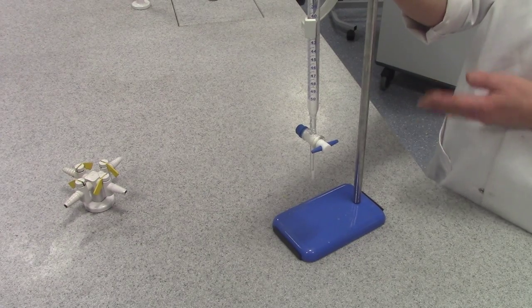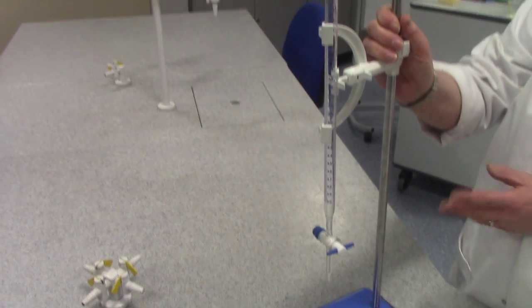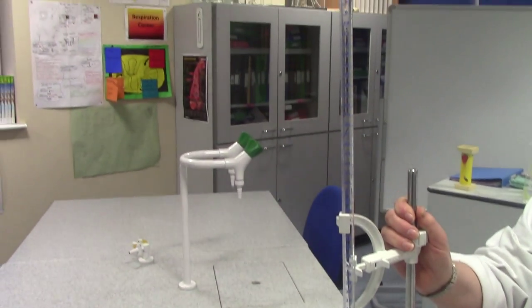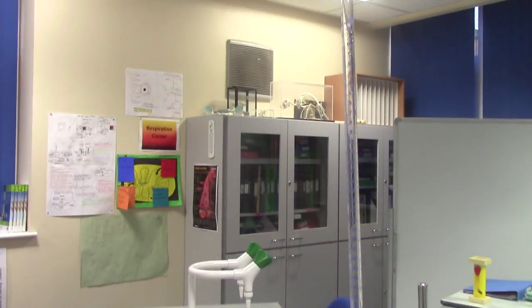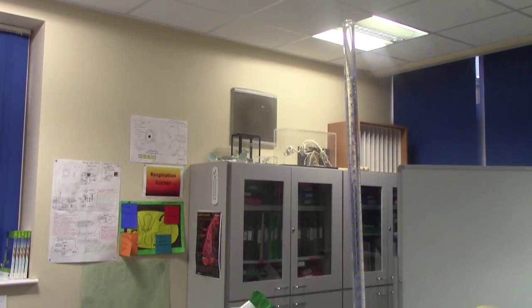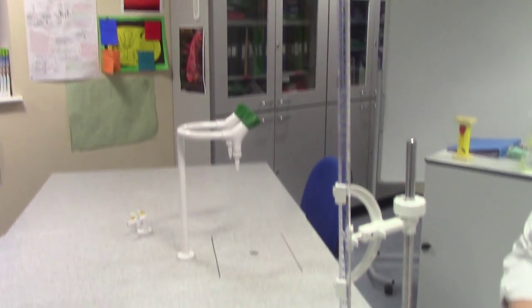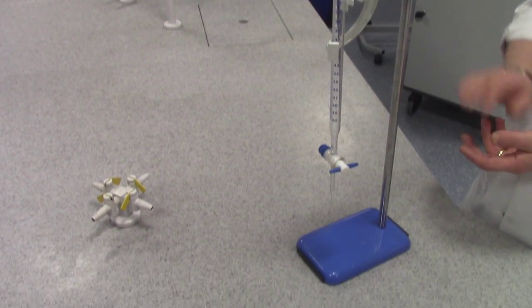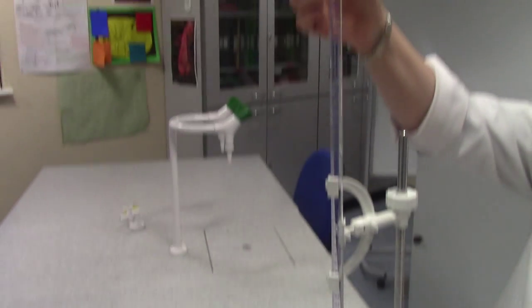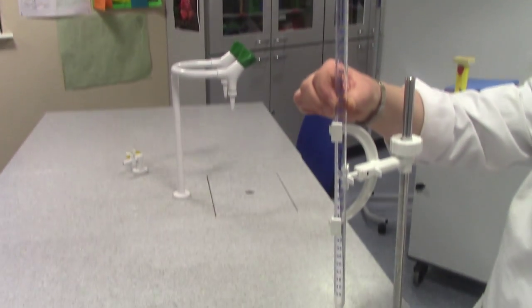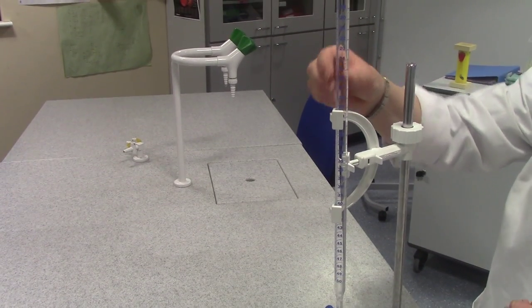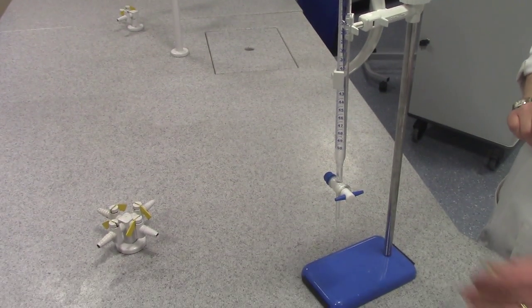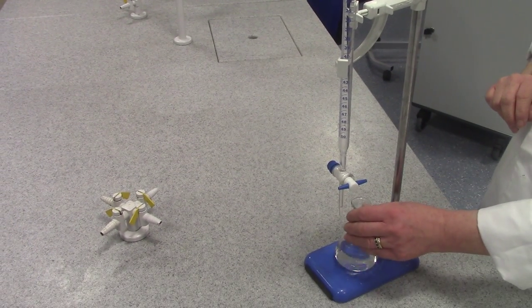This piece of equipment is a burette. It is used in a very common quantitative procedure called a titration. This is where two solutions react together and we record the precise volume of titrant, which is the solution in this cylinder, that reacts with a known volume of another solution called the analyte.